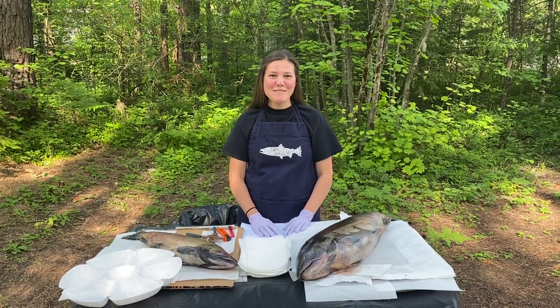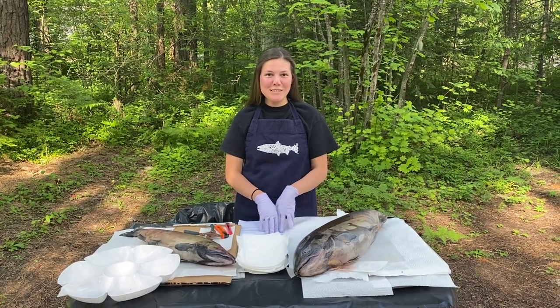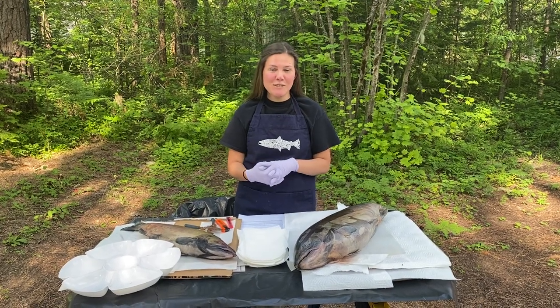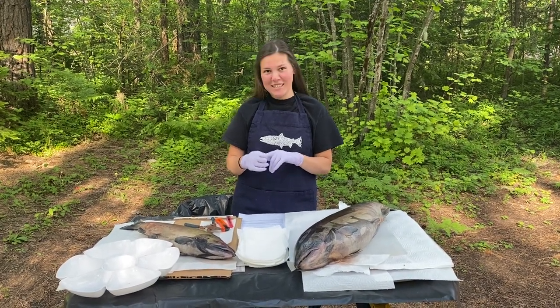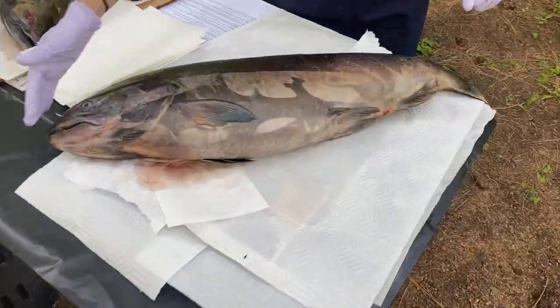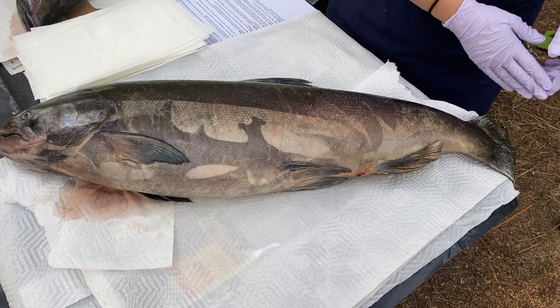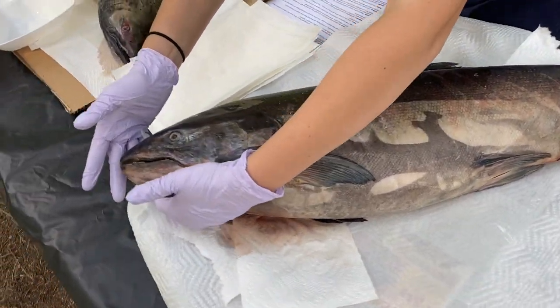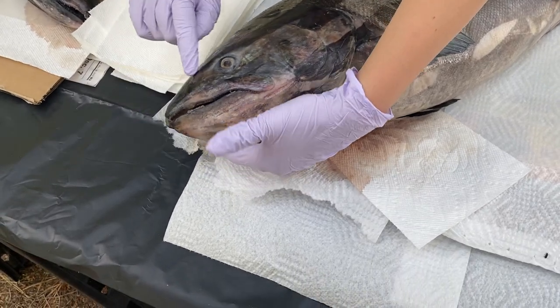I'm Emily with Mid-Columbia Fisheries Enhancement Group, and today we are going to be dissecting two adult Chinook salmon. We're going to start with the external anatomy and then we'll move into the internal anatomy. So we're going to start from the head and we'll work our way down the body till we get to the tail.